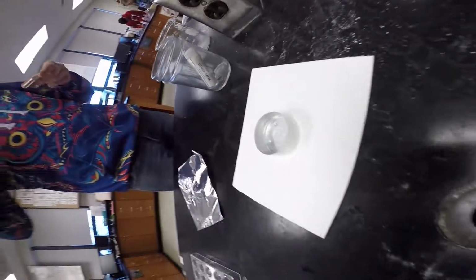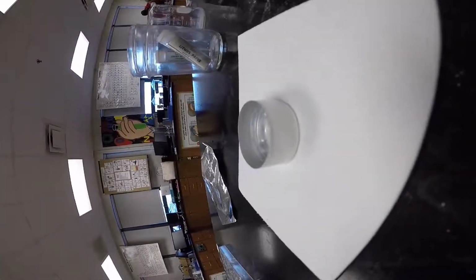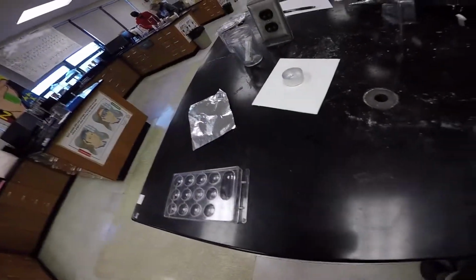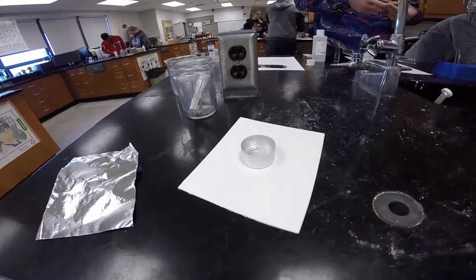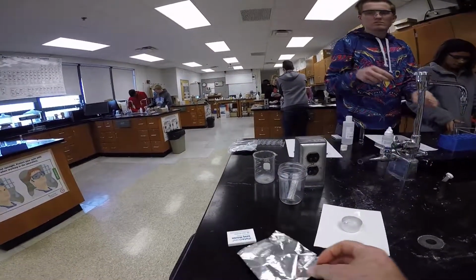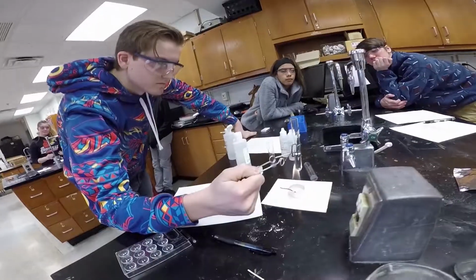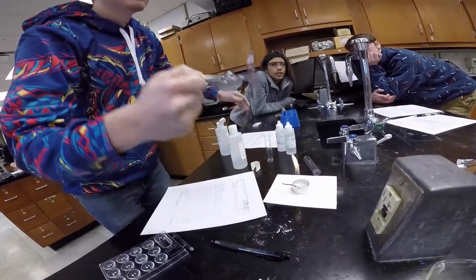So you can see that it is on fire there. Oh, yeah. It's pretty cool. So weird. How do you put it out then? You use the aluminum thing here. Smothers it. Oh. Is it like this little plating?